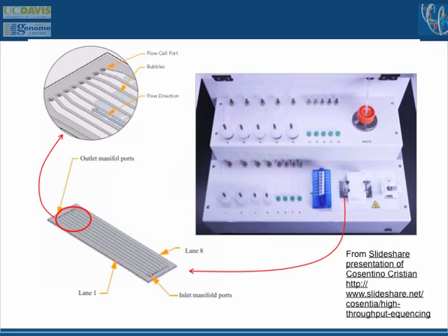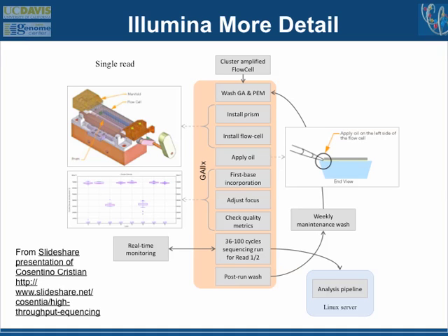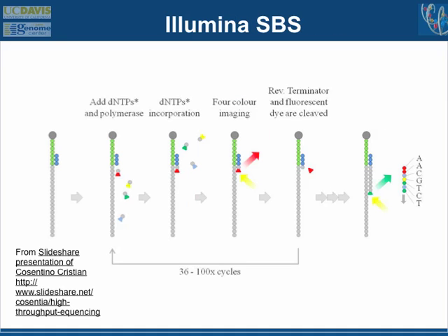So this is an example of one of the flow cells for the Illumina machine, and in essence, same general principle as most of the other methods. And you run however many cycles you can run. You get this phase problem with many of these methods, where as you get later and later in the cycles, if something has gotten out of phase with some of your pieces of DNA, the 99th base might be overlapping and being read with the 100th base. And you get some challenges as you run out longer and longer reads with many of the machines.